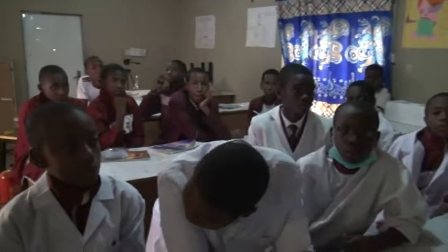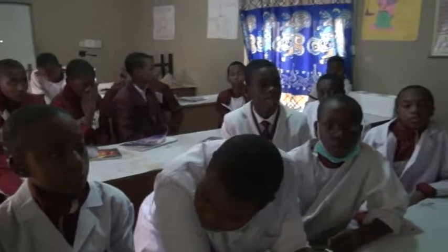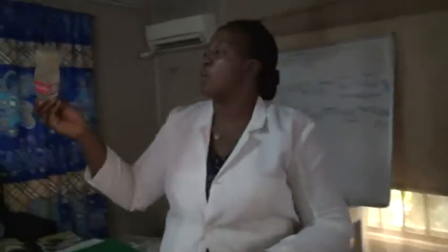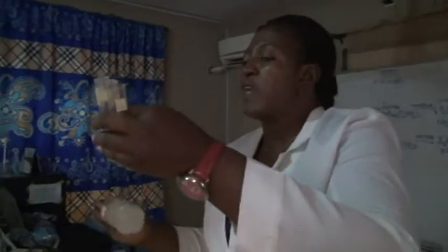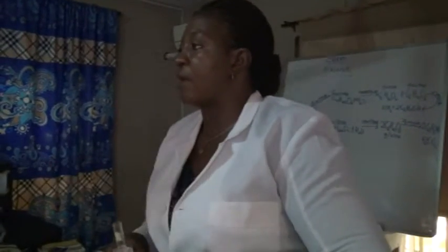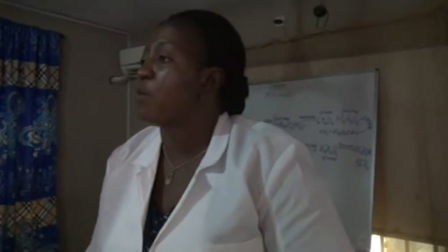So now we are going to do the same centrifugation. We have 4 test tubes here. We are grateful for those that have submitted some blood sample. We have the urine, and we also have the muddy water. So we are going to get these samples into these test tubes and then fill the last test tube with just distilled water, and now insert it into the manual centrifuge.